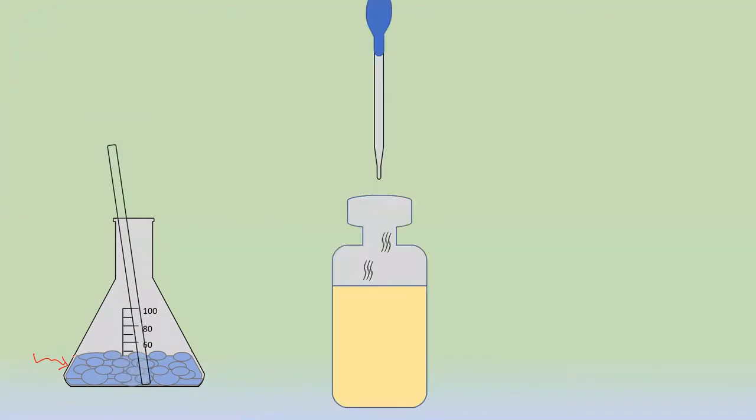Now we are going to carry out our second step. What was the second step? In the mixture, I now have the salt of benzoic acid. I want benzoic acid, and to recover it from the salt, I need to acidify the solution. For acidification, I'm going to use concentrated HCl. So what is expected? Put in drops of concentrated HCl and stir the solution. As you stir the solution slowly, the white solid of benzoic acid will start coming out. You can stir it with the help of a glass rod, or you can take the conical flask in your hand and mix the solution.